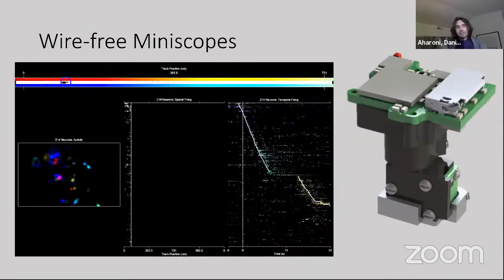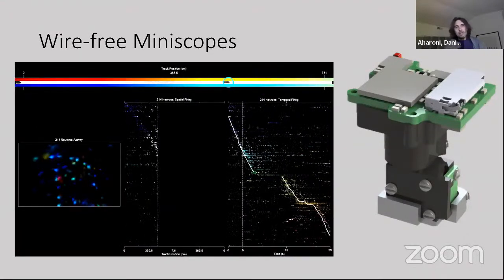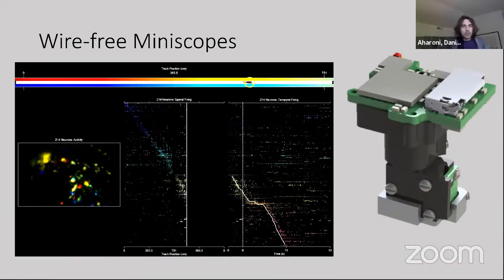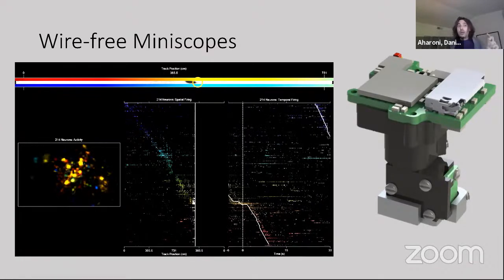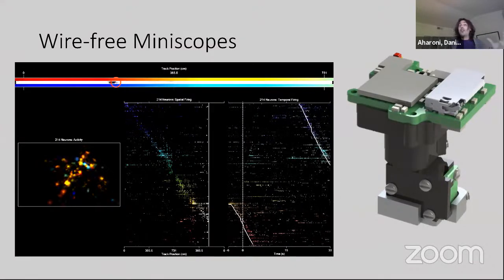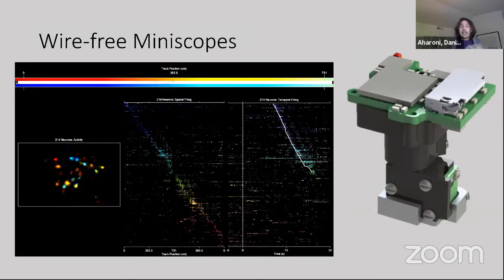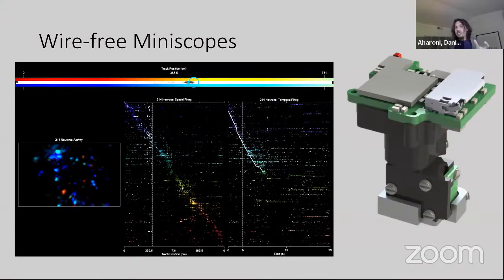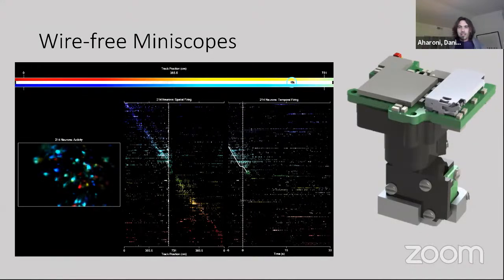This is the same data. We can extract place cells and look at spatial coding as the animal explores these large environments, but for the sake of time, I'll skip over. So this is the version 3 wire-free miniscope. It's a previous generation wire-free system that's openly available, and a few companies sell modification kits to convert a wired miniscope to this.